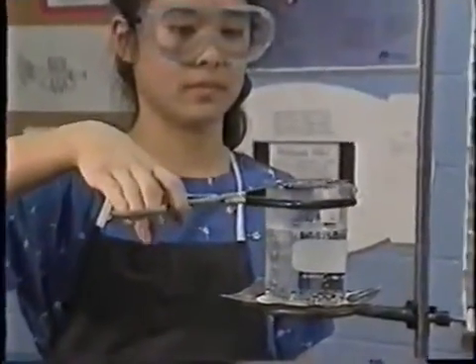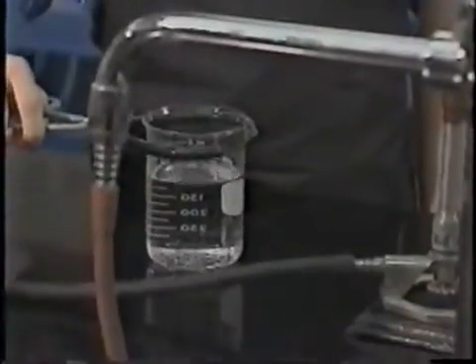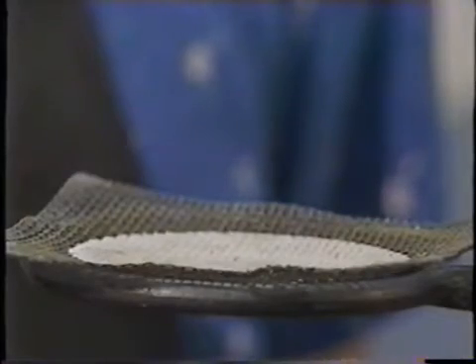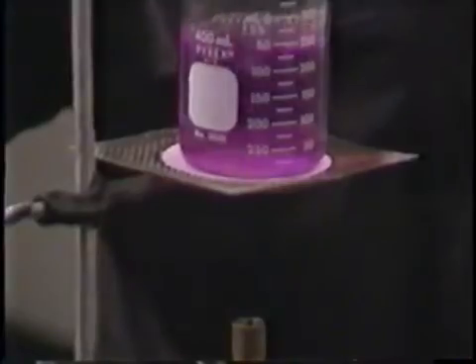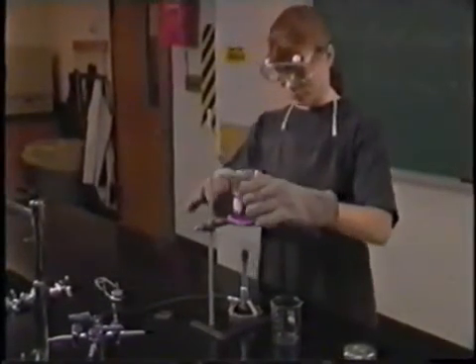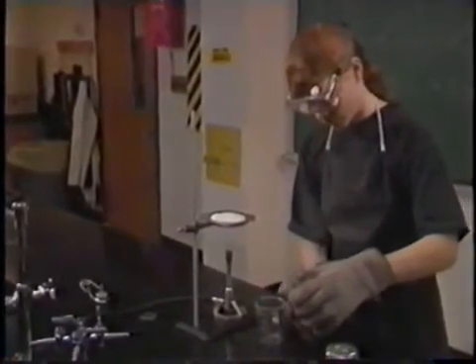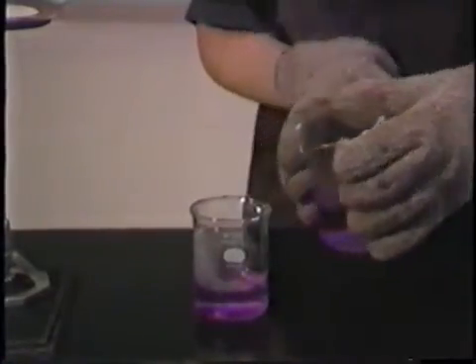Be extra careful when working with heated equipment. Hold hot glassware with beaker tongs, never your hands. Remember that the wire screen and ring stand are also hot. If you don't have tongs, protect your hands with gloves designed for hot glassware, but keep them away from the flame. Handle everything as if it's hot if you've been using a Bunsen burner. Glass and metal look the same when hot as they do when they're cold.